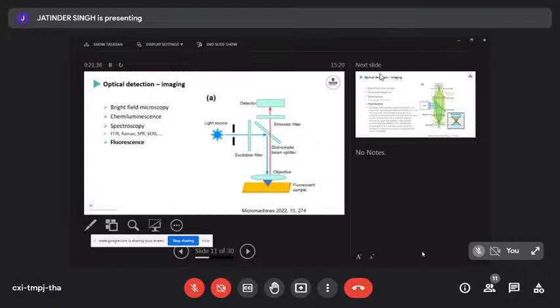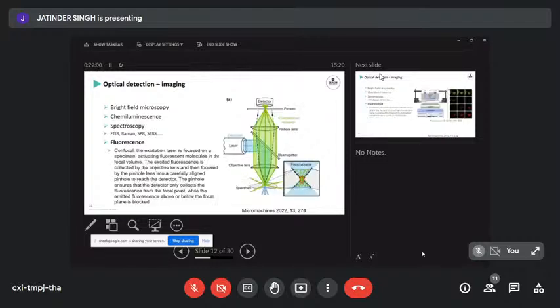But we've got, again, the light source. We filter the light here as well so that we know we've got a really narrow wavelength band. A beautiful dichroic mirror reflects first the light down, gets focused onto the substrate, then up to the detector. The setup is exactly the same for a point detector as for an imaging one, other than if we go really special for the confocal images, then we can also reconstruct a 3D image. So in normal fluorescence microscopy, the difference in Z direction is quite big and you can't quite get the Z resolution.